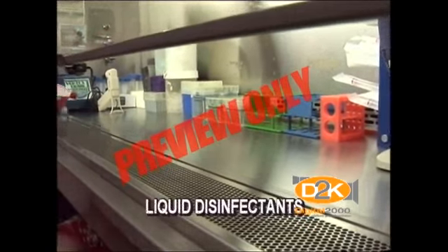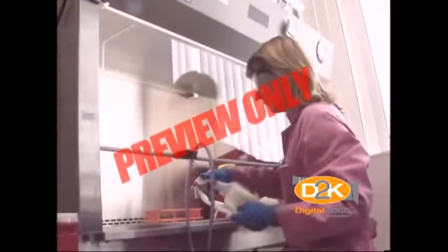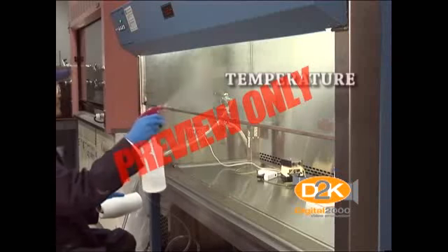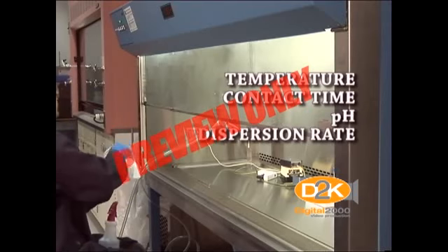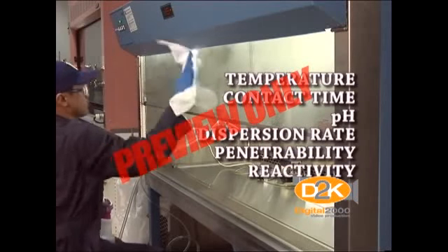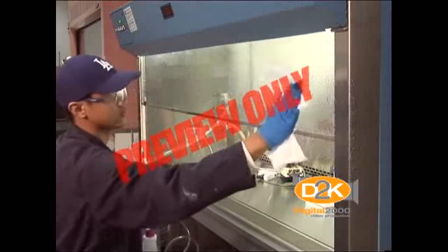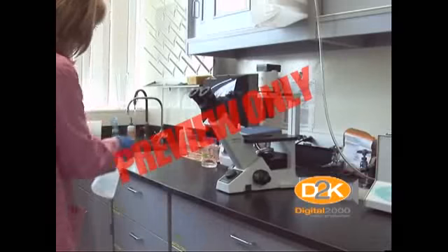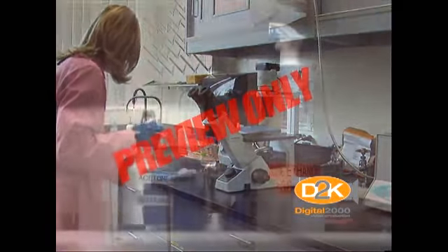Liquid disinfectants are frequently used for surface decontamination and, at sufficient concentration, to decontaminate liquid waste. Factors such as temperature, contact time, pH, dispersion rate, penetrability, and reactivity of the material at the application site must be considered when selecting the appropriate disinfectant. Hazardous properties of the disinfectant relative to its efficacy must also be considered.